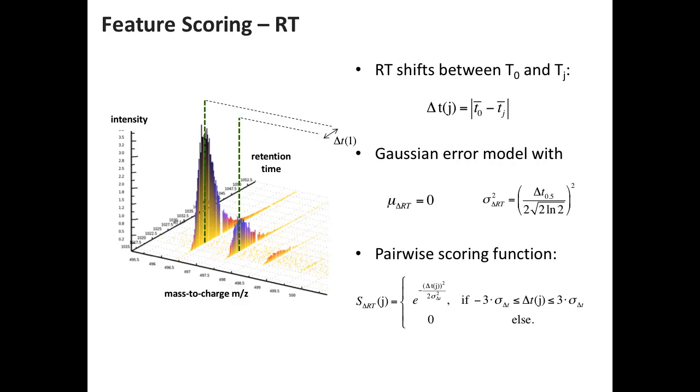Because we see that in metabolomics, the peak shapes are often even weirder than what you would expect in proteomics. And that has a nice side effect. You can also apply that same algorithm to data from, say, capillary electrophoresis, where you have peaks that are basically rectangular. So it works well, and you don't have to make any assumption on the peak shape. You just have to have a rough estimate of how large your peaks are. And again, the algorithm is pretty robust. Whether you're off by a factor of 2 or 3 in this parameter, that won't matter.